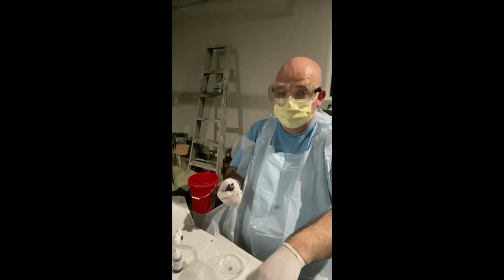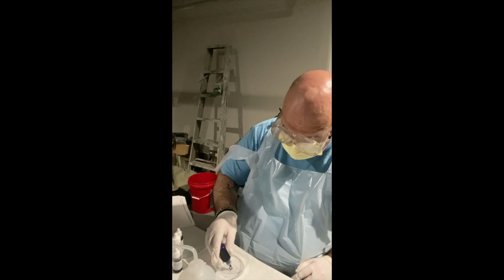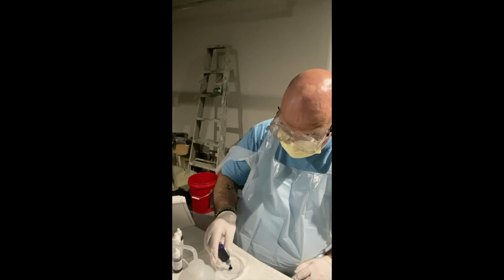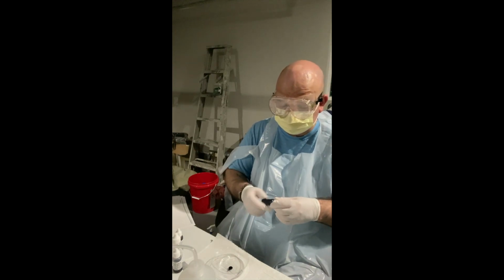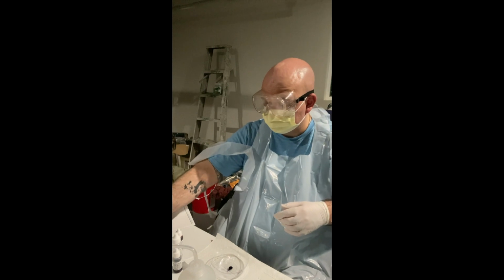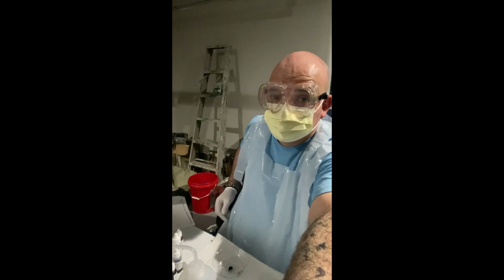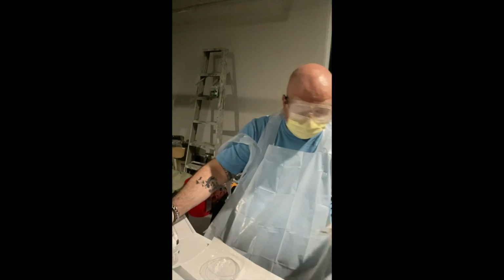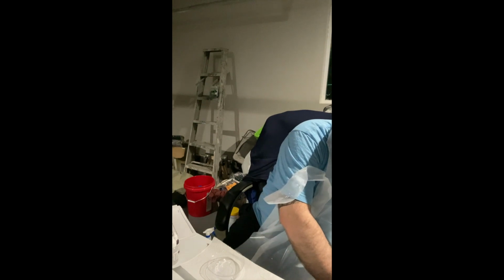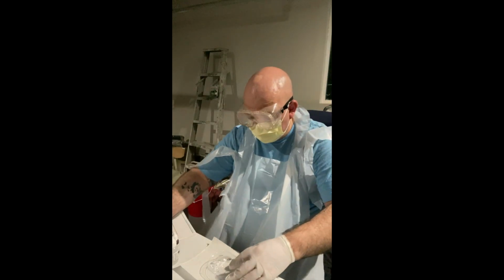And then once I've placed the 2 drops on, I'll wait for 60 seconds and then rinse it with tap water. So there's 1 drop. 1, 2. And we'll wait just about a minute. All right, so it's been a minute, so I'm going to go ahead and rinse my stain again with tap water. Okay. Back into my tray.